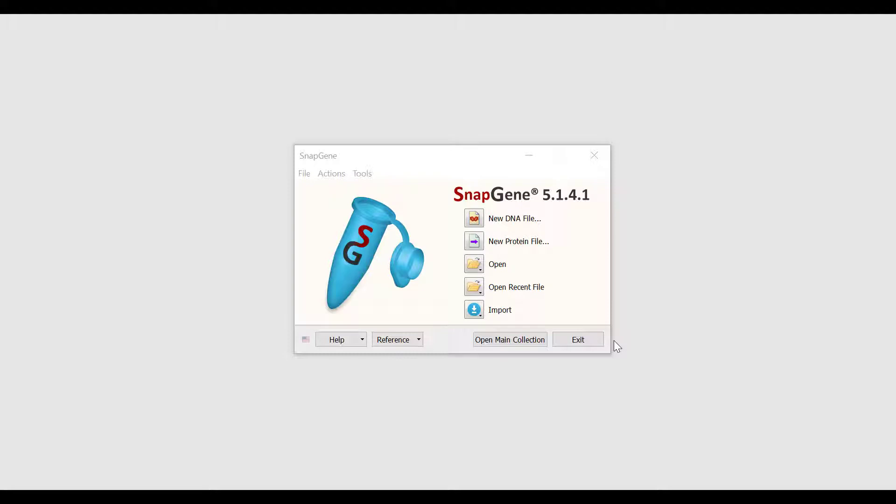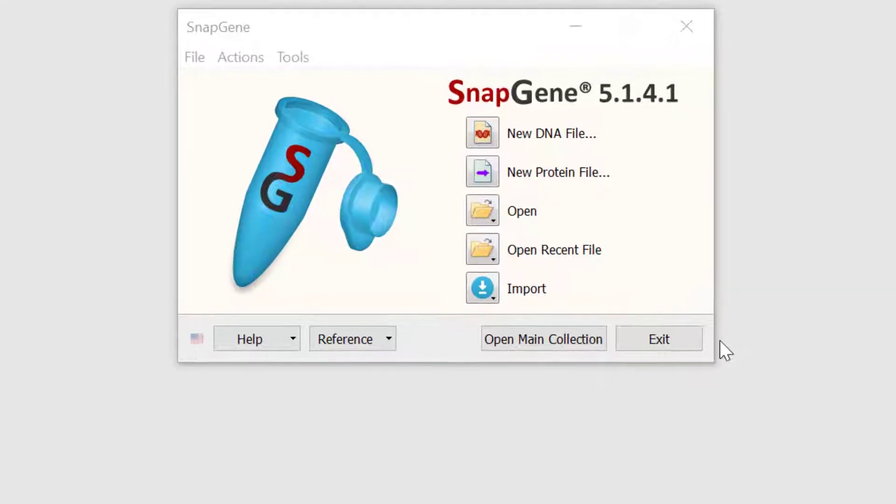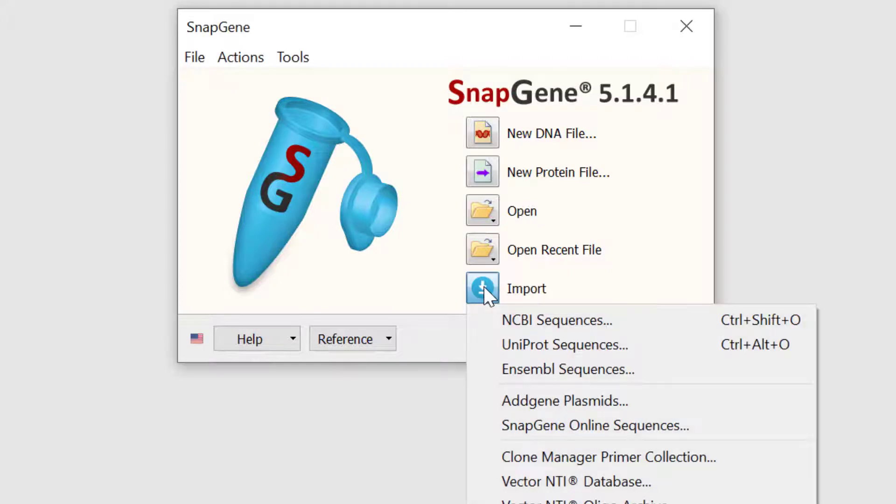We will explore the ways to simulate inserting a single fragment into a plasmid vector using restriction cloning in SnapGene. To start with, I will import a plasmid that I will use as the vector. There are multiple ways to do this. The first begins at the SnapGene welcome screen. From here, go to import and select a desired database.